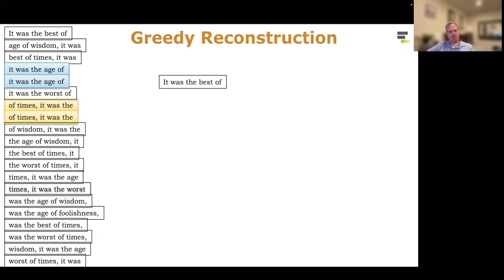And the whole business of genome assembly is we have a fragment and we want to figure out which fragment comes next, right? This process is highly analogous to completing a jigsaw puzzle, where those jigsaw puzzle pieces lock together based on the shape. Here, we're going to have these little slips of paper locked together based on the words, the sequences that are written upon them. Specifically, we're looking for pairs of fragments where the end of one fragment matches the beginning of the other. That's the key concept that we're looking for. This is called an overlap.